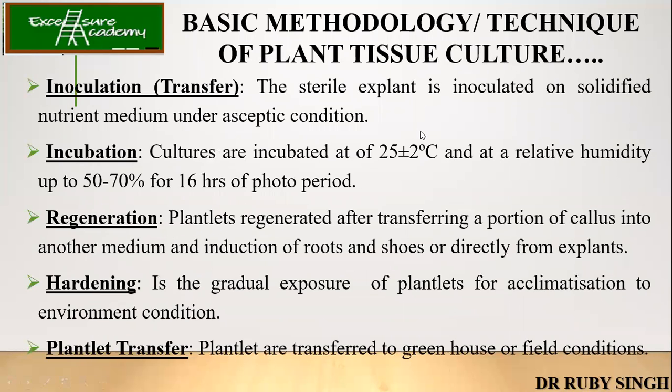Inoculation. Once the explant is sterilized, you are going to inoculate, that is, transfer it onto the solidified media under aseptic conditions. Usually we use a laminar airflow hood to carry out this experiment. Then you keep it for incubation. For incubation you have the transfer room, which has controlled temperature, relative humidity of around 50 to 70%, and the photoperiod. If you remember from the previous lecture, we have talked about the photoperiod.